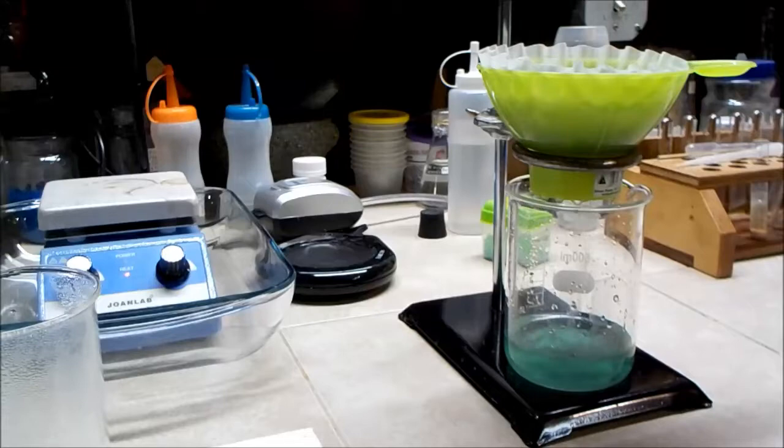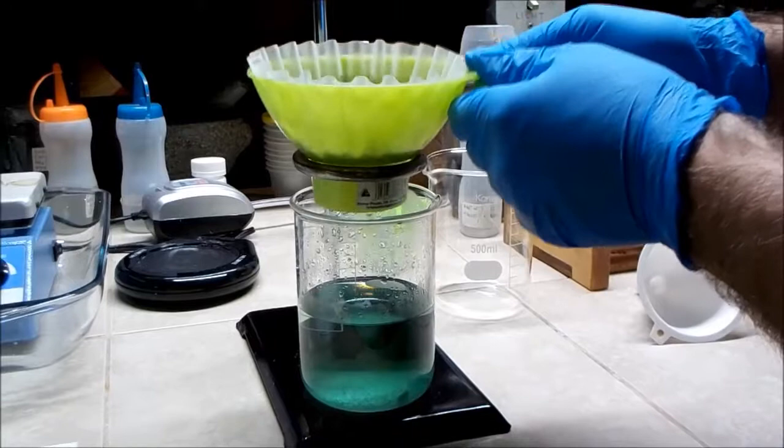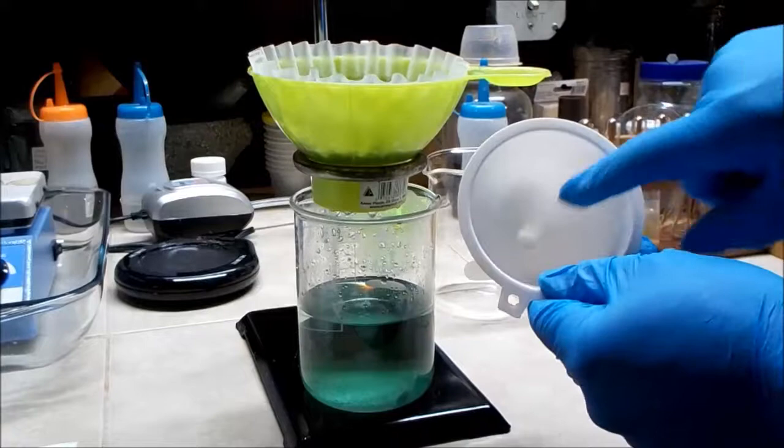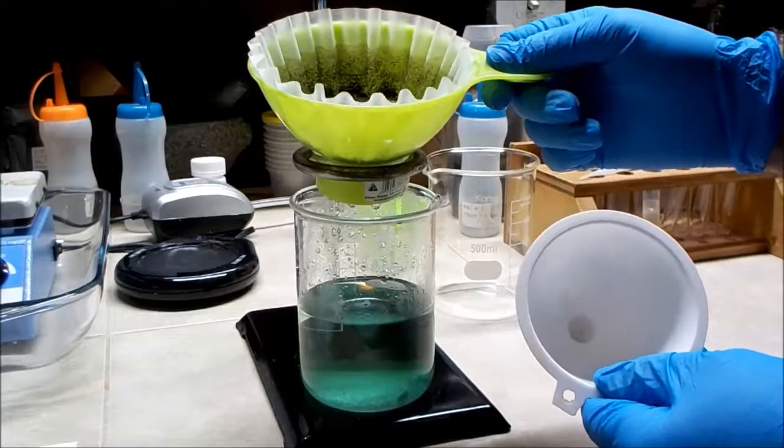So the addition of the hot water worked out nicely. After only a few minutes, everything has gone through the filter. And we have this residue, as you can see, so I'll be filtering this again. This time, I'm going to use this funnel with a little bit of cotton tucked down in the bottom of the neck, and I find that cotton removes finer particles than just a coffee filter. So I'll go ahead and do that.